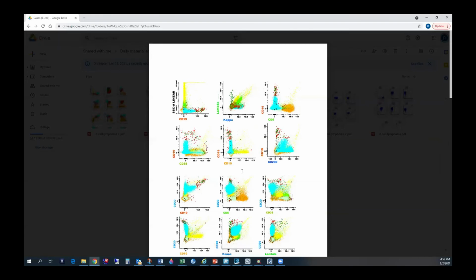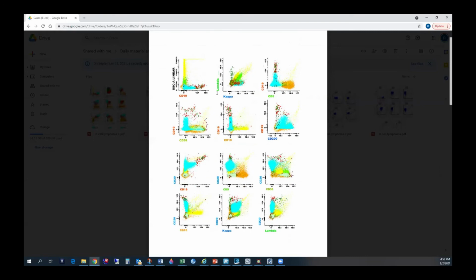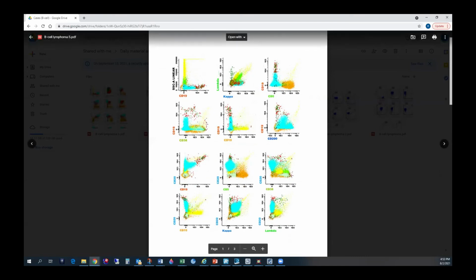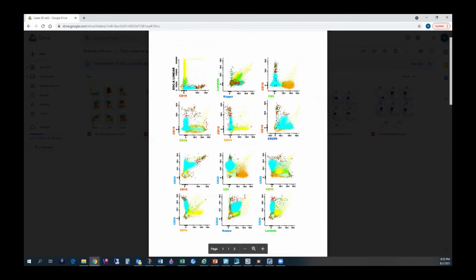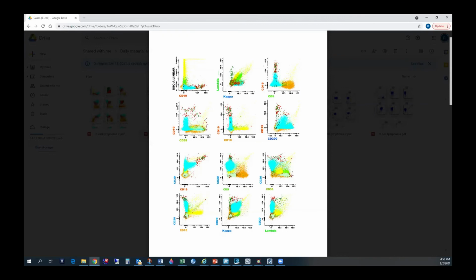What else can we see, but I think we don't have markers to... okay, this one, this orange population that is positive for CD5, negative for CD19. T cells? Negative for CD20. T cells, yes, exactly. So you can tell what they are. The fluorescent green is actually monocytes, but we don't have any markers to say that, so forget that. But anyway, if you try to analyze one by one, you can tell what they are.